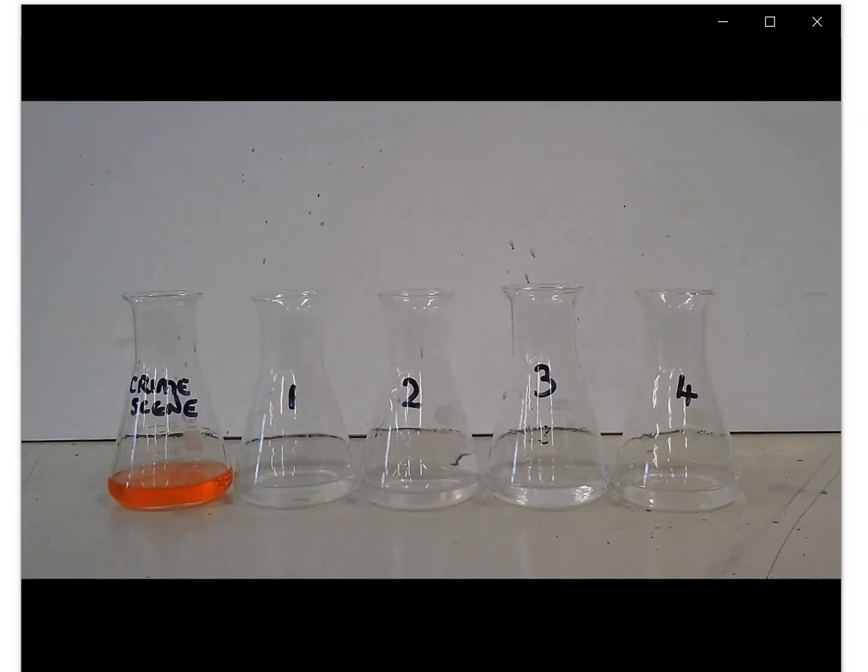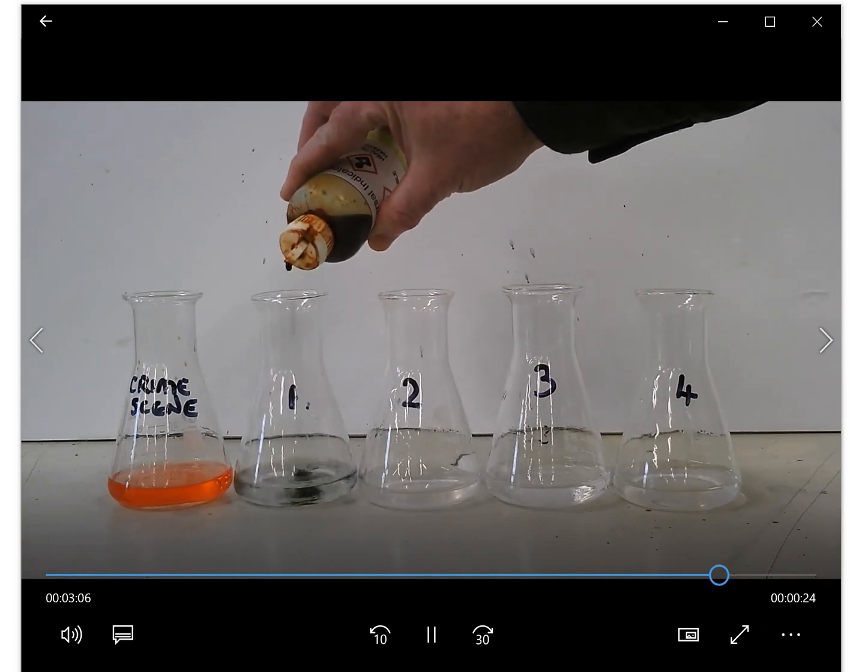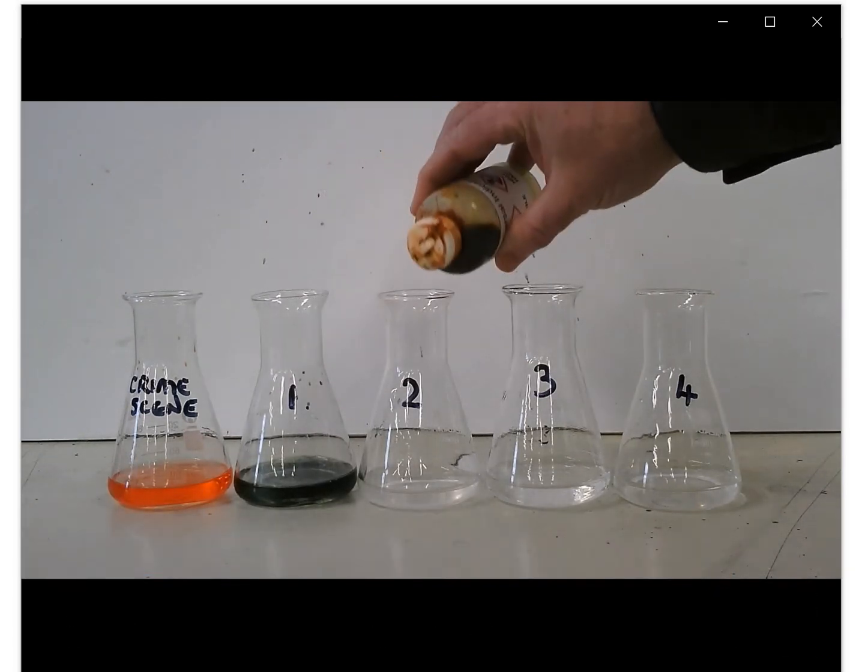So here we've got the extracts from the 4 suspects as well. We're going to add universal indicator to each one.